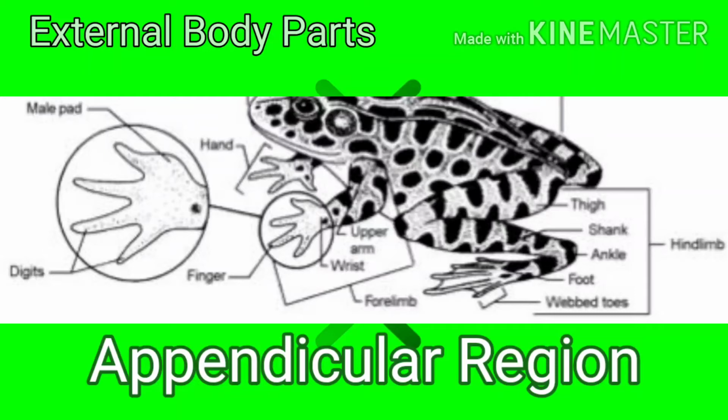The hind limbs are the posterior appendages. Each is also divided into segments. The first segment attached to the body mass is the thigh. The segment immediately next to the thigh is the shank, then followed by the tarsus or ankle, then the pes or the foot, which is the part of the limb distal to the tarsus. Then it is followed by the toes or the digits, usually 5 in number.